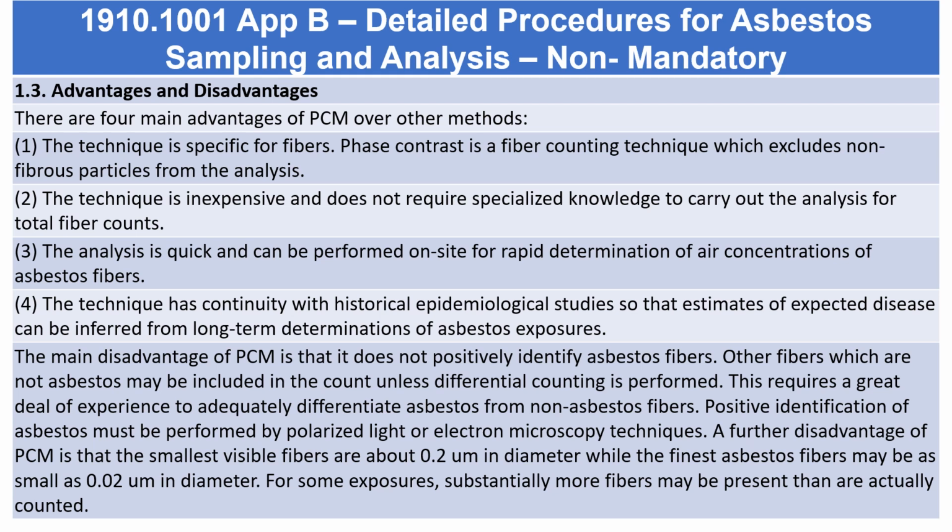4. The technique has continuity with historical epidemiological studies so that estimates of expected disease can be inferred from long-term determinations of asbestos exposures. The main disadvantage of PCM is that it does not positively identify asbestos fibers.